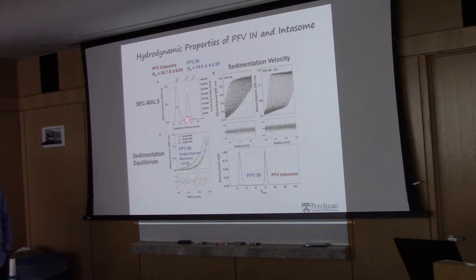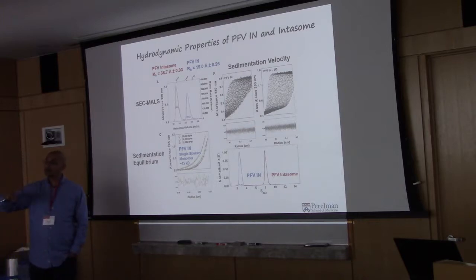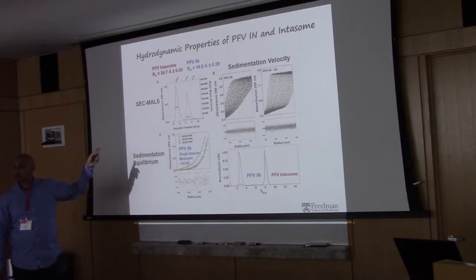And the monomer, both in SEC-MALS here, was very consistently monomeric, not only by SEC-MALS, but also by sedimentation equilibrium analysis and sedimentation velocity analysis. Together with Sophia Kendrick at Wyatt Technologies, we have an application note coming on SEC-MALS using something called a conjugate analysis, where you can take advantage of the multi-angle light scattering and solve a series of linear equations to derive the mass of conjugate systems like protein-DNA complexes or lipid-membrane protein. So we're using this test case here to demonstrate that algorithm. So we'll have that application note.